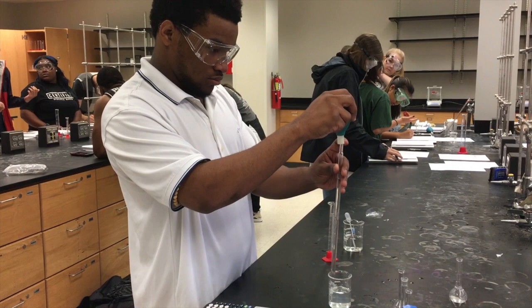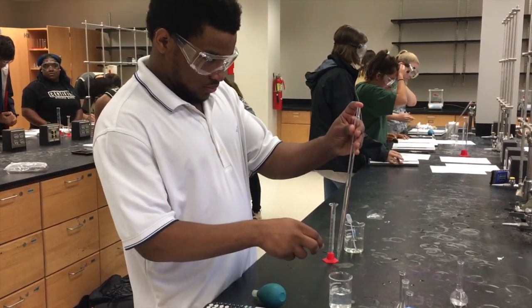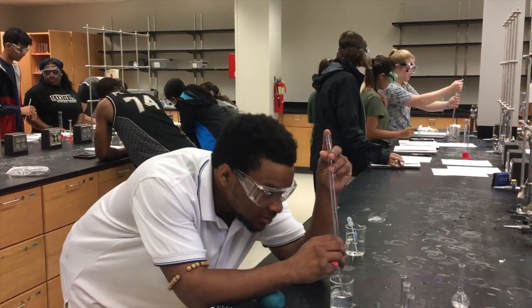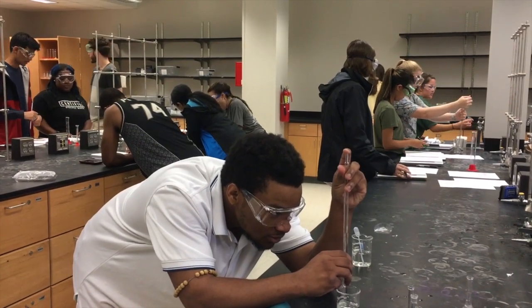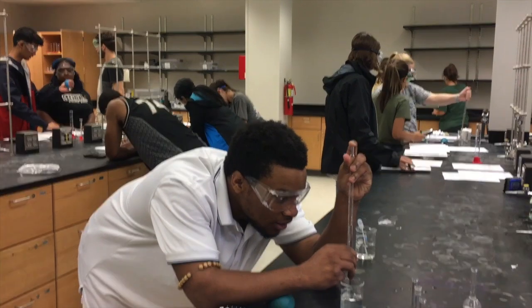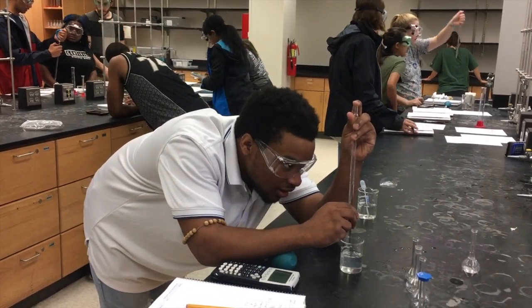To begin diluting a solution, start by using a pipette to draw up the 20% stock solution by squeezing the bulb on the top of the pipette and releasing. The solution will draw up into the pipette. Here, you will remove the bulb and place your finger on the top of the pipette prior to taking the initial measurement. Here, you should mark your measure to the bottom of the meniscus.